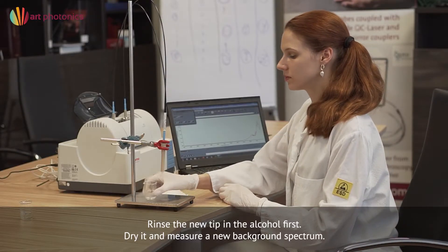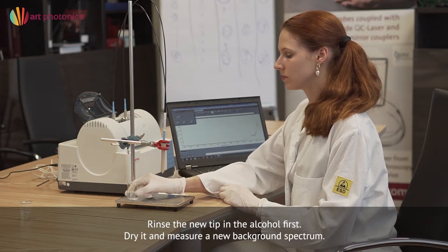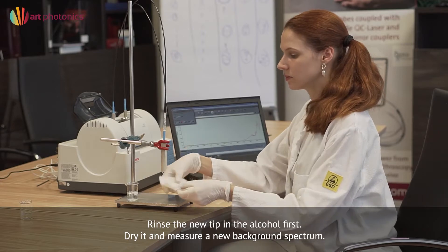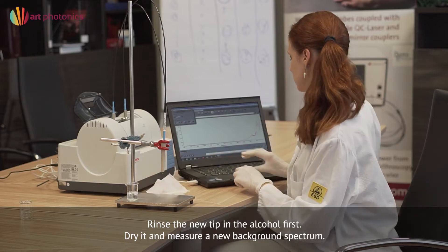Rinse the new tip in alcohol first to remove possible contamination from fingers. Dry it and measure a new background spectrum, because all loop tips have a slightly different throughput.